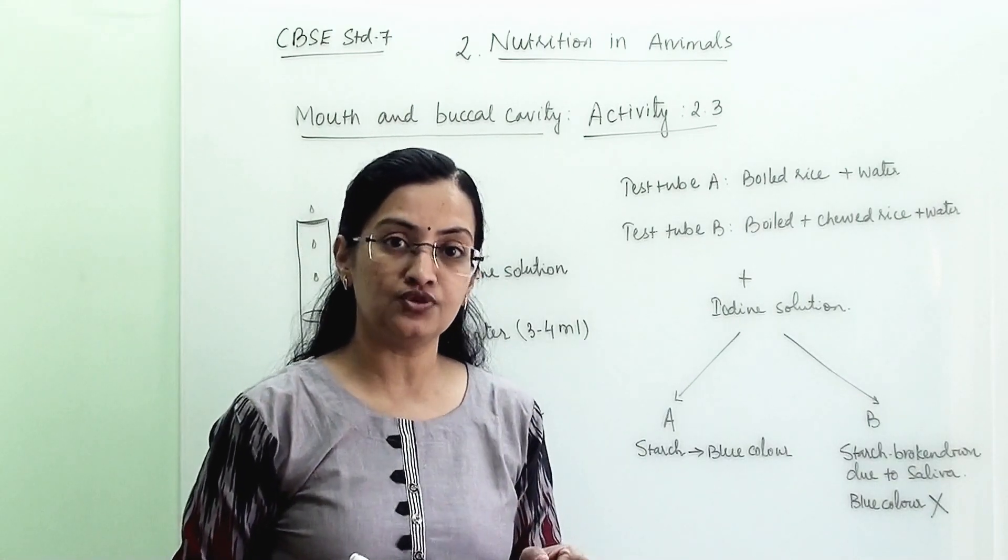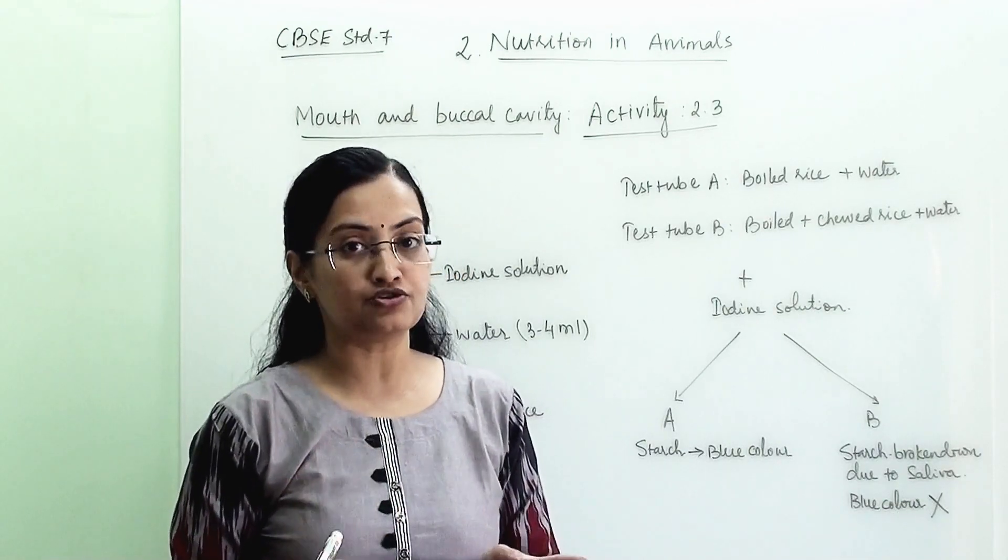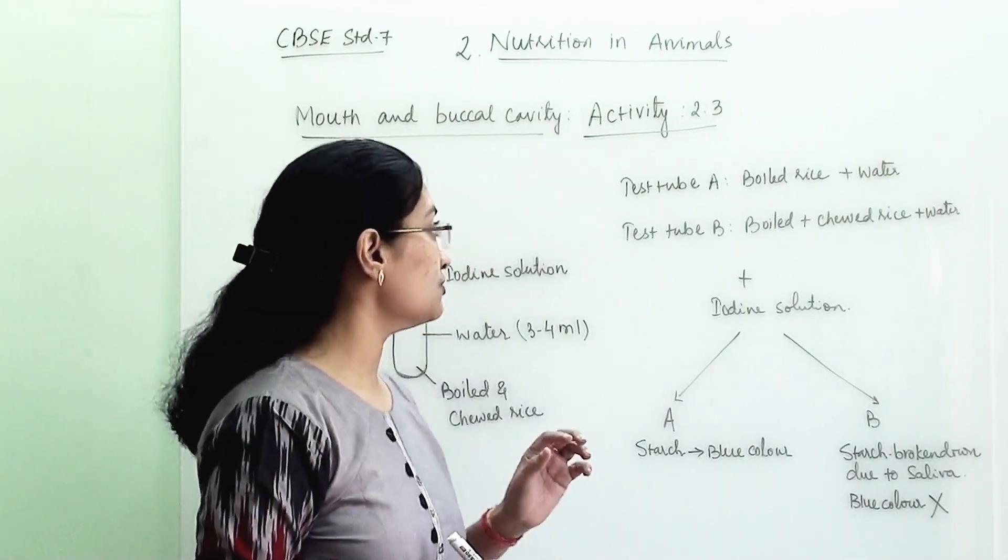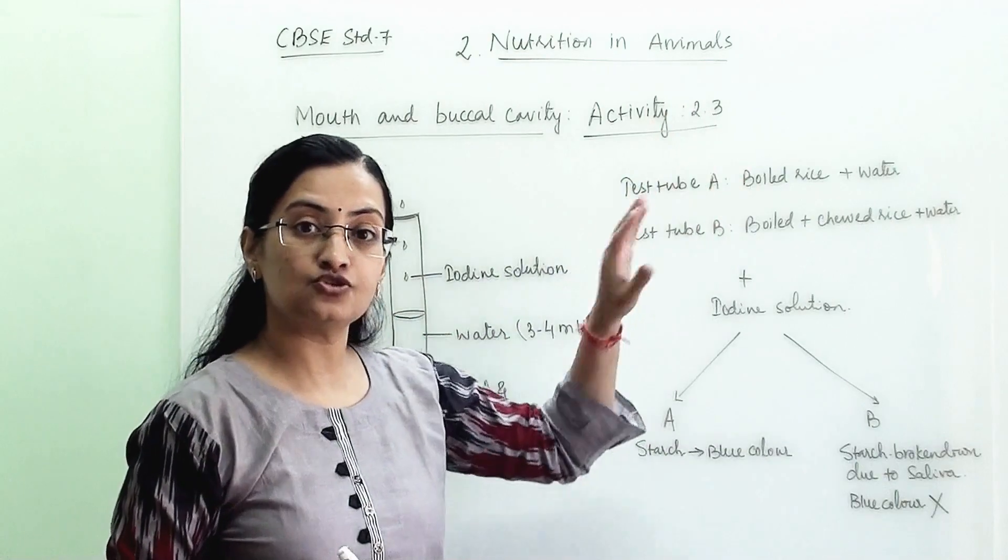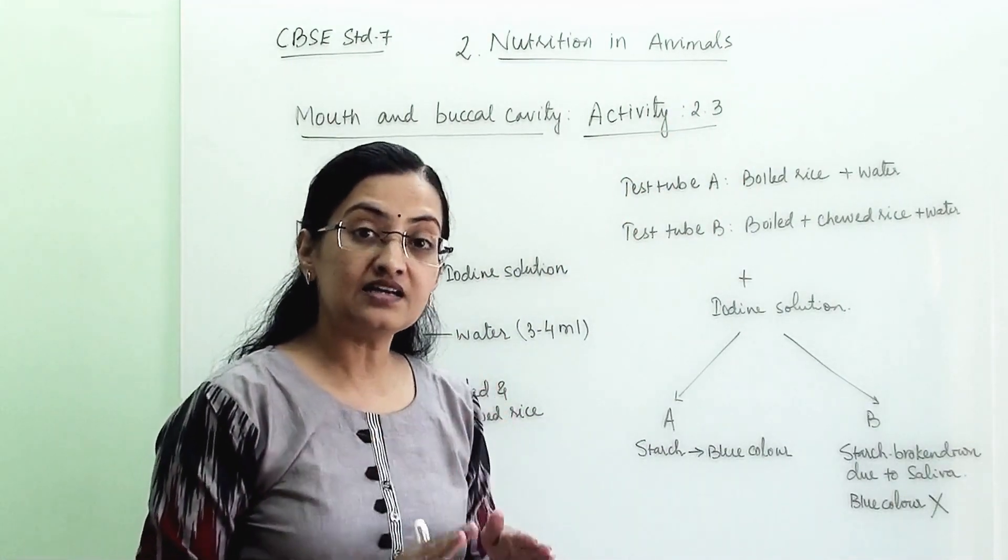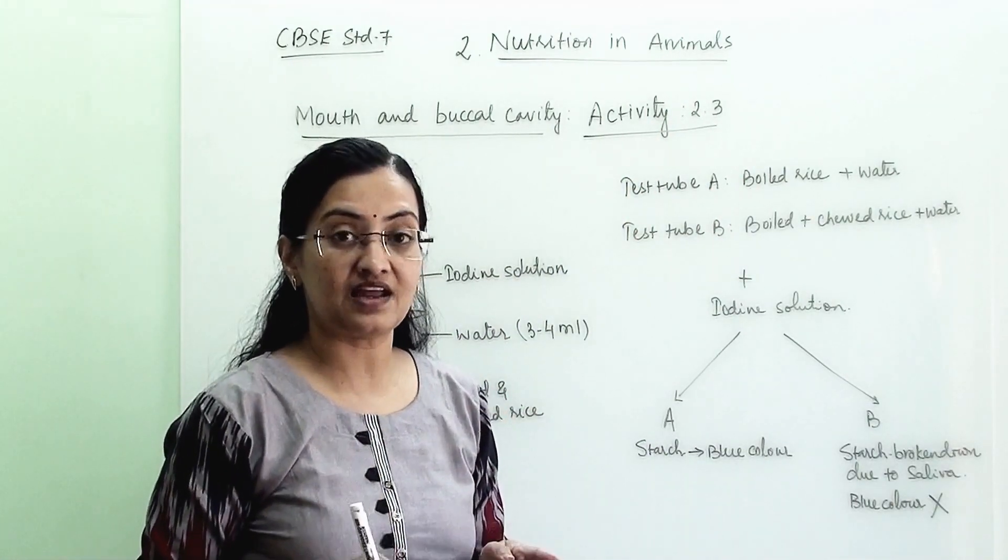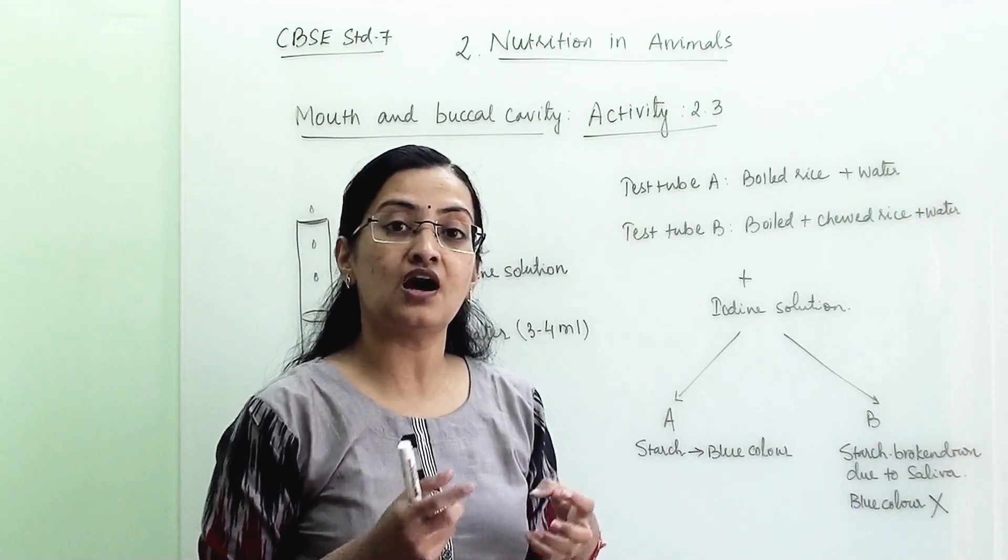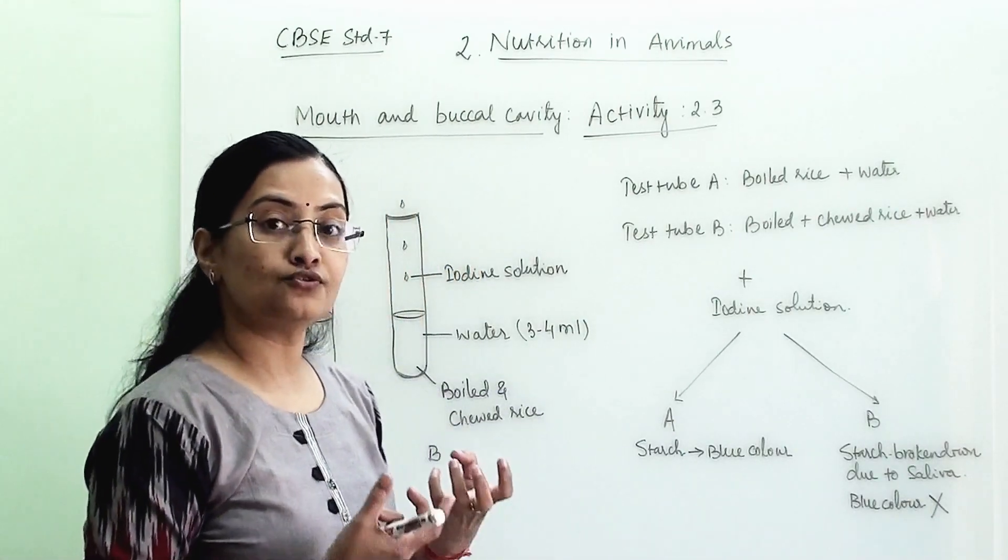When it will get mixed with the food, it will break down the starch into simple sugar. Here we are conducting one activity, that is activity 2.3, and we will understand what is the function of saliva, when it is getting mixed with the food, how it is changing our food.